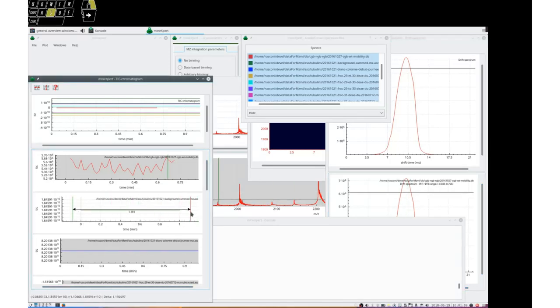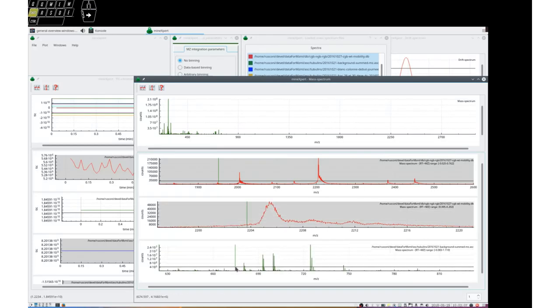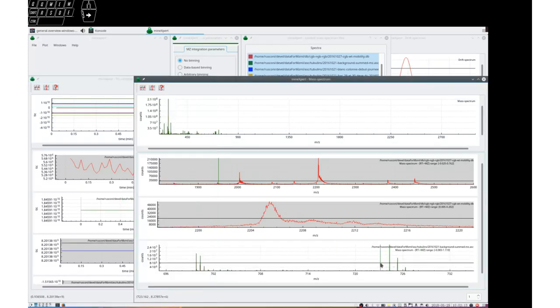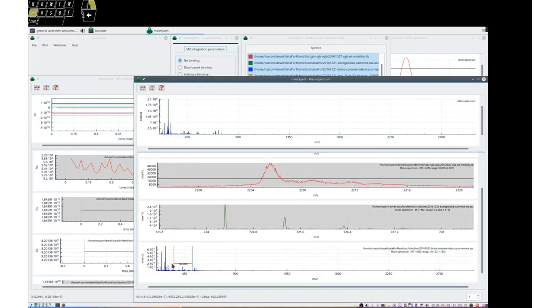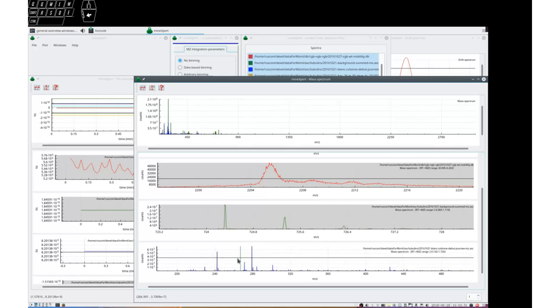For example, here, if I integrate that spectrum file into a mass spectrum, I will have a corresponding color here. Green, green. There we are. Another integration from this file will provide a trace with the same color. So this is called the root widget, and these the descendant widgets. Any descendant widget must have a root widget.